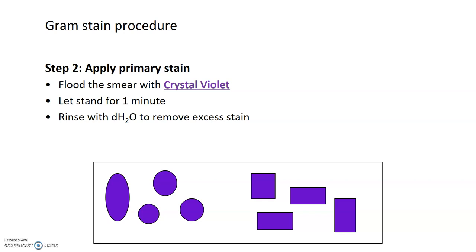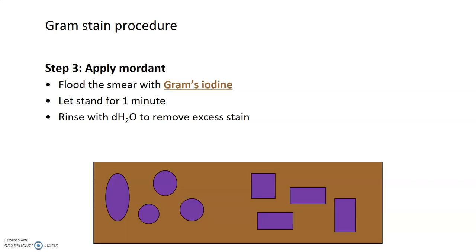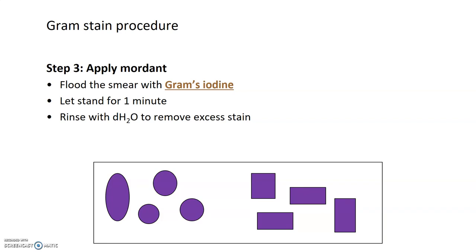It's positively charged and it'll bind to all of the cells on your slide, regardless of whether they are gram-positive or gram-negative bacteria. Then you need to apply what's called your mordant. In the case of Gram staining, this mordant is Gram's iodine. You will flood the smear in the same way you did with crystal violet, but this time with this brown solution of Gram's iodine, and also let it stand for 1 minute, and then rinse that stain off with deionized water in the same way you removed the crystal violet.